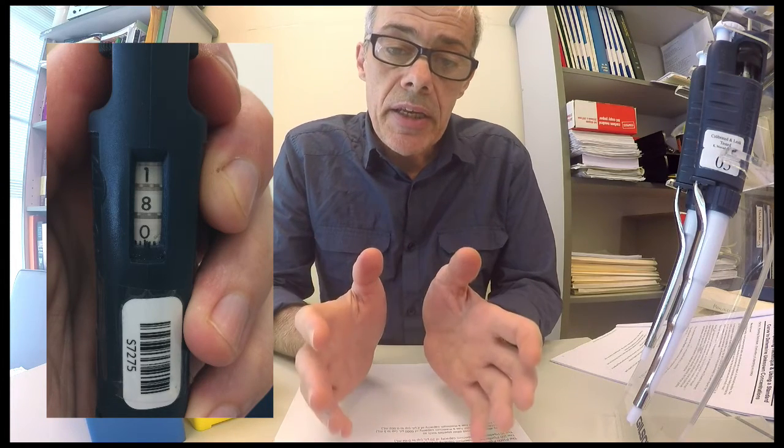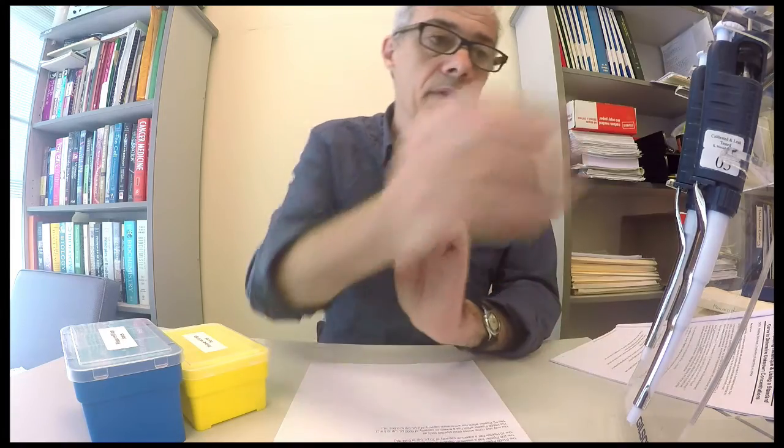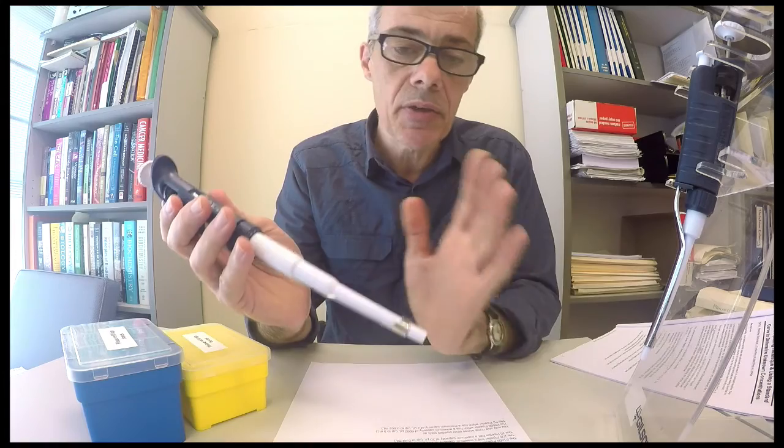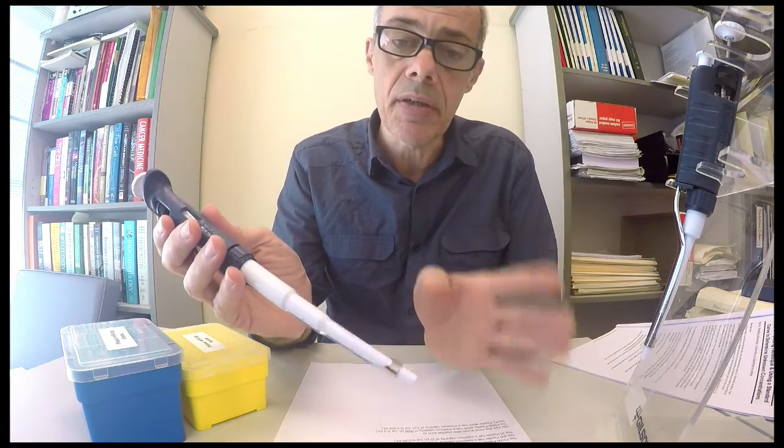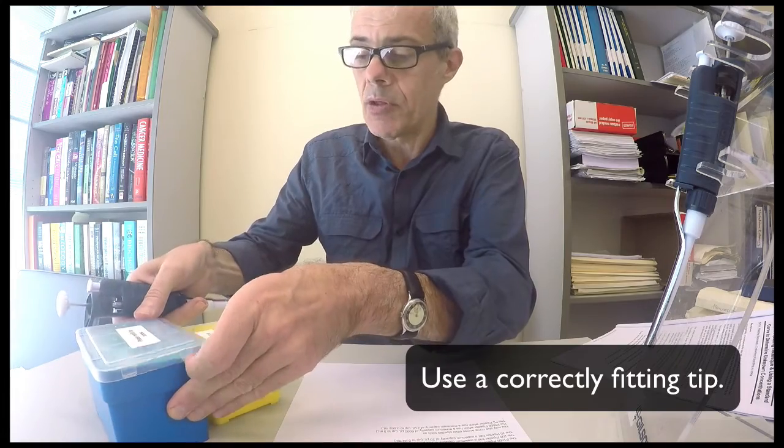The next thing you need to be clear on when using pipettes is putting the right tip onto the bottom of the pipette. So this is a pipette but it doesn't have a tip on the end, so it can't be used until it's fitted with its tip. So here is a box of tips.